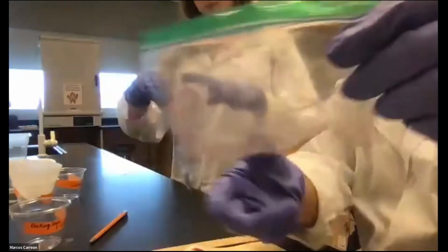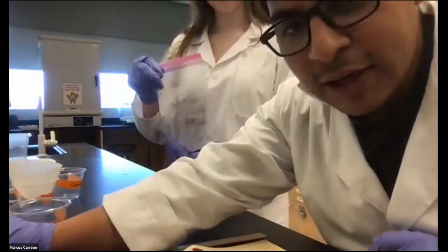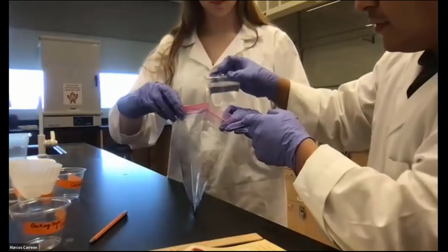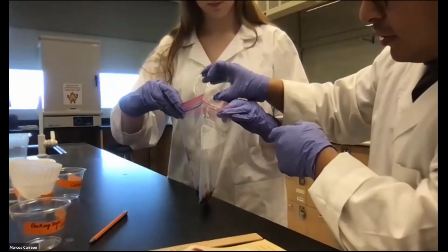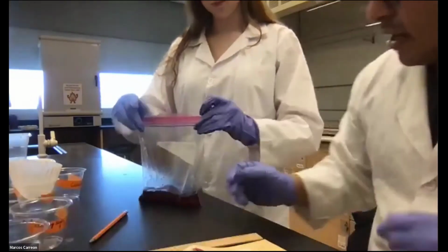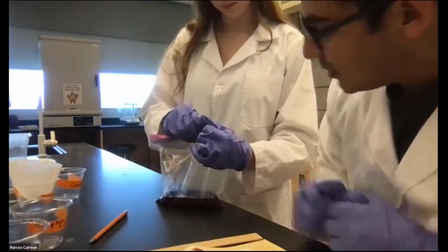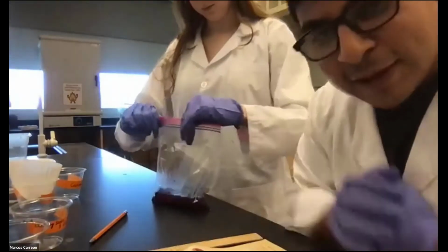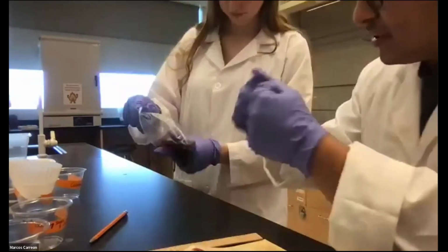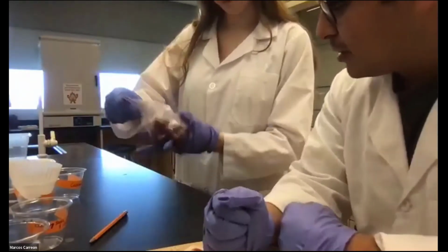So again, we move the bugs from here into this other bag. And then we're gonna add a cup of water to that. Already have it. Do that now. So she's now gonna close that bag really tightly. Make sure there's no open things because she's gonna shake it now. If she didn't close it correctly, it's gonna spill all over the place. She's gonna go ahead and shake it. You want to shake it, make sure everything's all homogenized there.